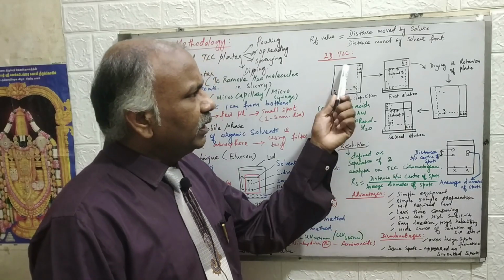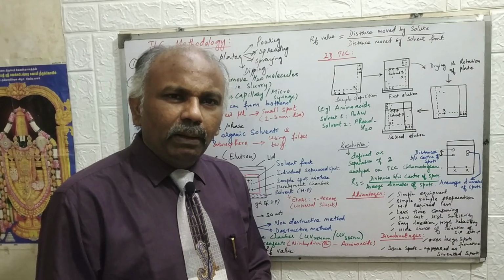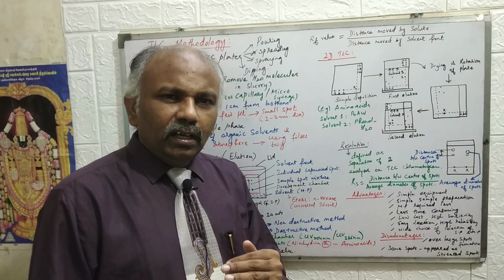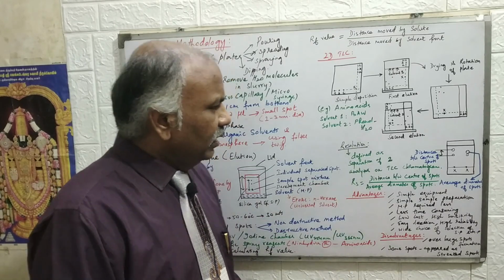Two-dimensional TLC is very widely used. If you want to identify bulk samples, or if you want to separate a sample from a larger number of mixture components, then we can go for two-dimensional TLC.